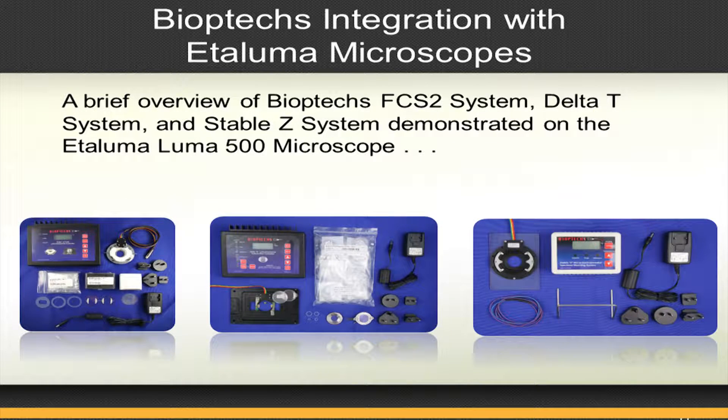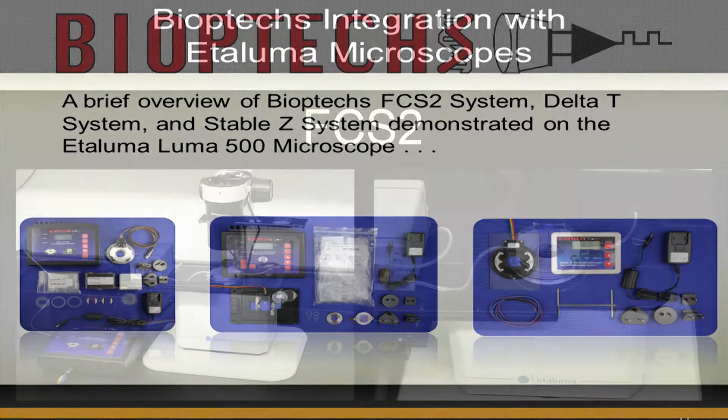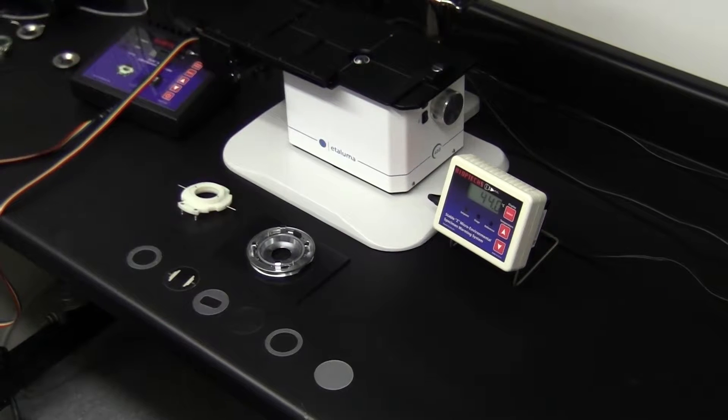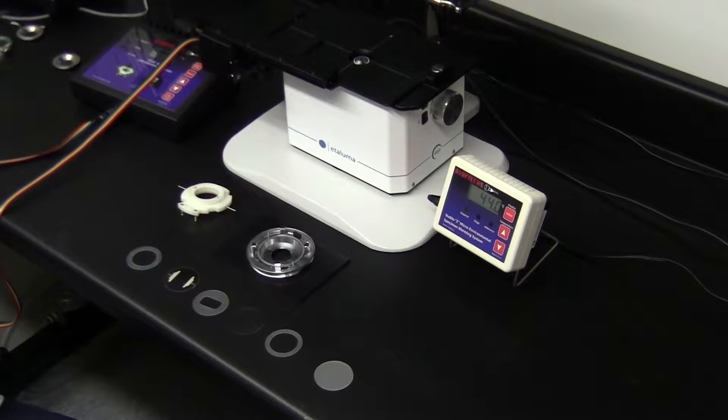The following is a demonstration of Bioptechs products as narrated by our founder and developer, Dan Fokt. This is an FCS2 flow cell on the Etaluma microscope. Here we have eight individual components that make up the optical cavity for the cells.